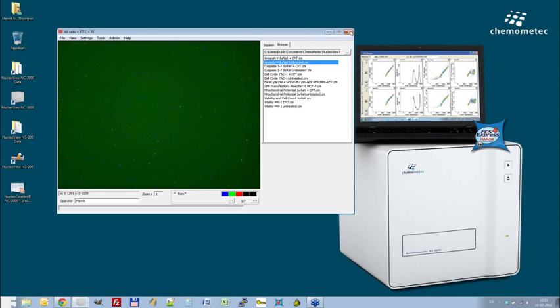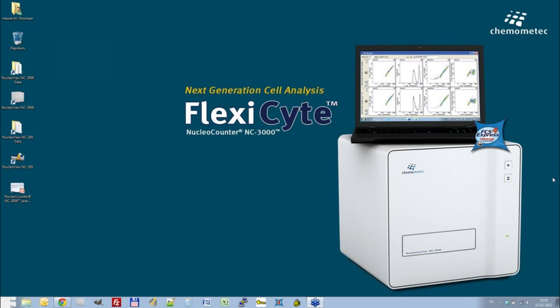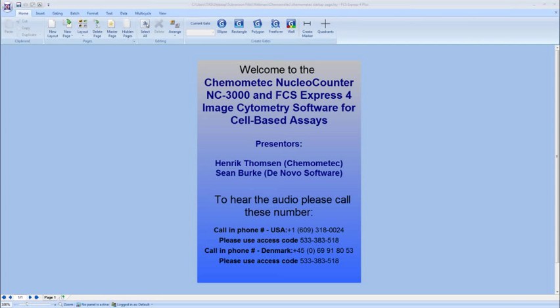So I will hand this back to Sean now. All right, Henrik, thank you very much. And let me show my screen here. Very good. So if there's any questions about anything you've seen or that Henrik has talked about thus far, please make sure to type those questions in the questions and answers box there. I'm sure Henrik will be happy to answer those questions as we're going.